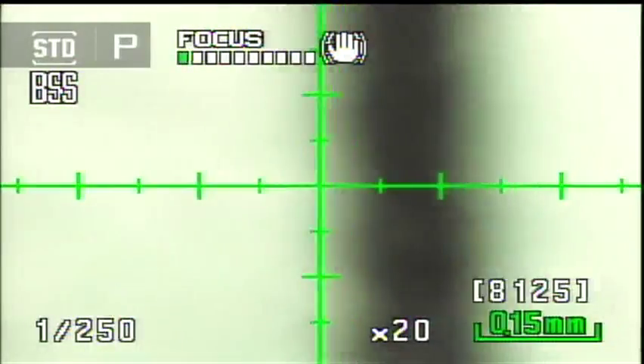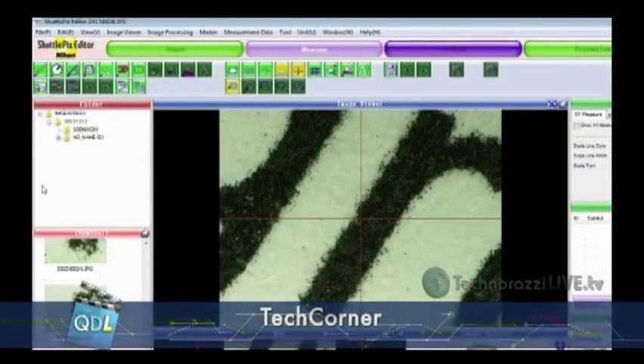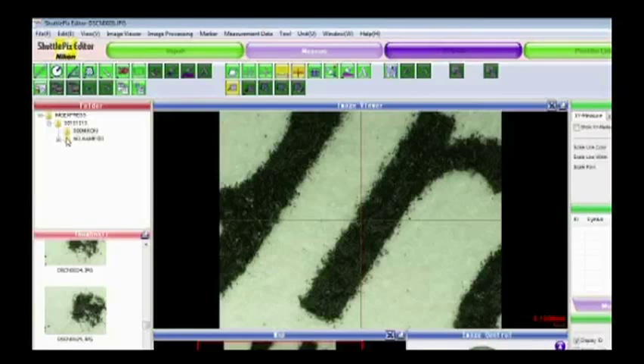After taking pictures, the data is stored on an SD card. I can take that card, put it in my laptop, and bring the images into the Shuttlepix Editor. The editor is divided into four areas: on the left is standard folder navigation, and below that are thumbnail images of everything in the selected folder.